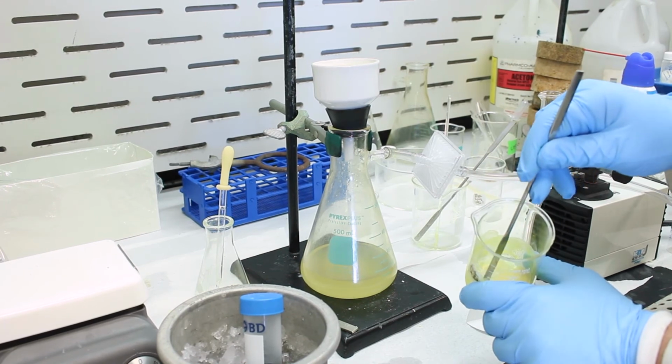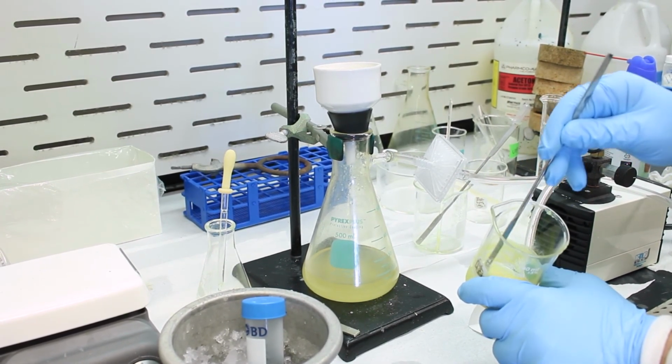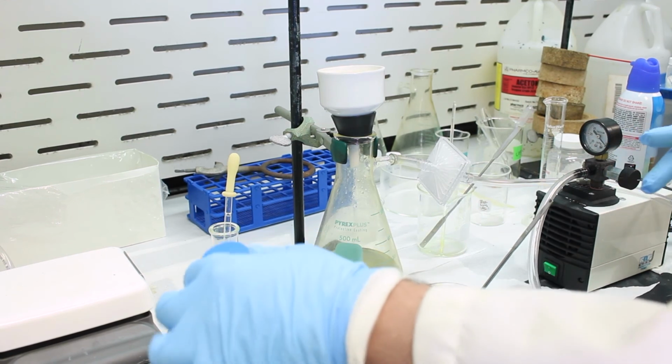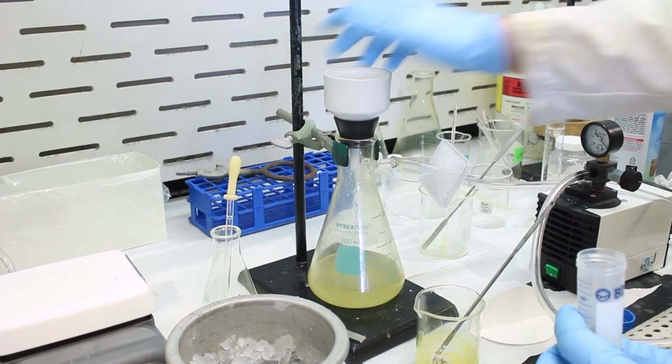With the ethanol, the solid was much darker, so here it's a much lighter yellow, akin to what we would expect for the product. So we're going to filter it now, and we've got some cold ethanol to wash things through.